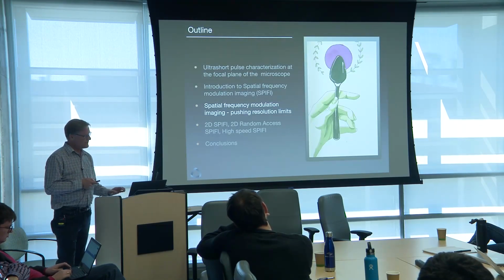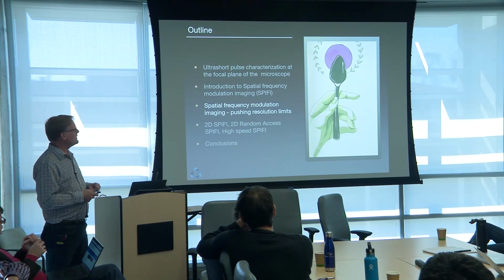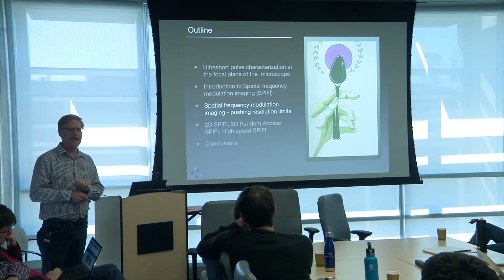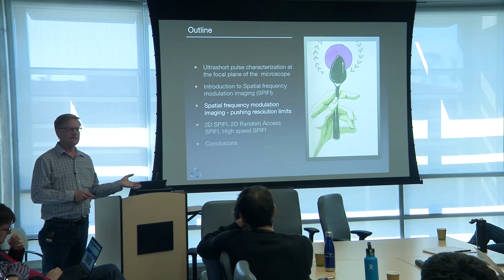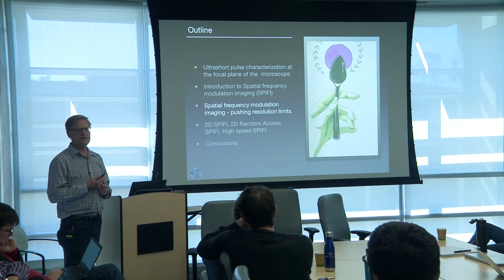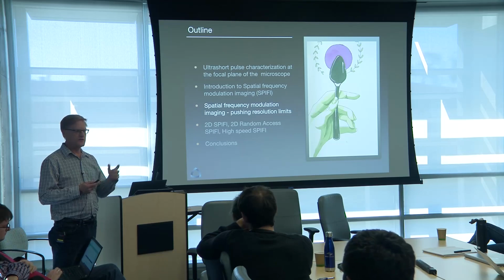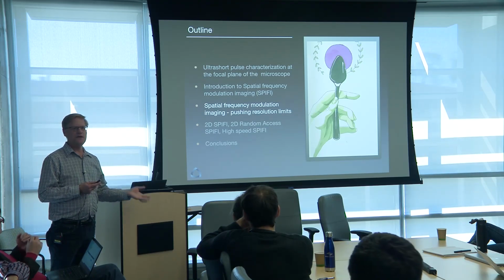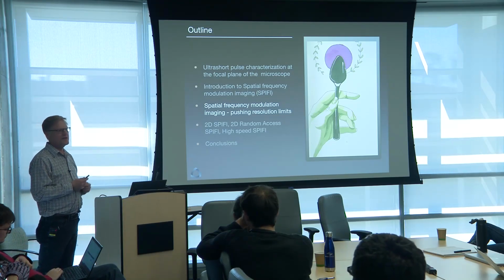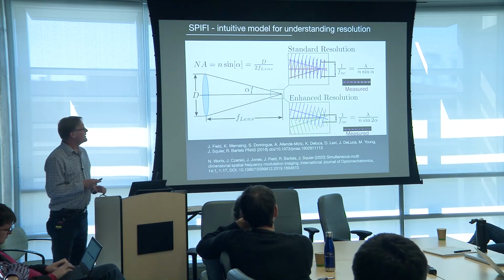But now there was a surprise waiting for us when we were actually taking the Fourier transform of these signals in the lab. We noticed that when we looked at higher carrier frequency, there were other images there for free. And it turns out those other images are all at much higher resolution than the fundamental image. So we were able to get enhanced resolution out of the system for free. Not what we intended, but it's actually what happened.